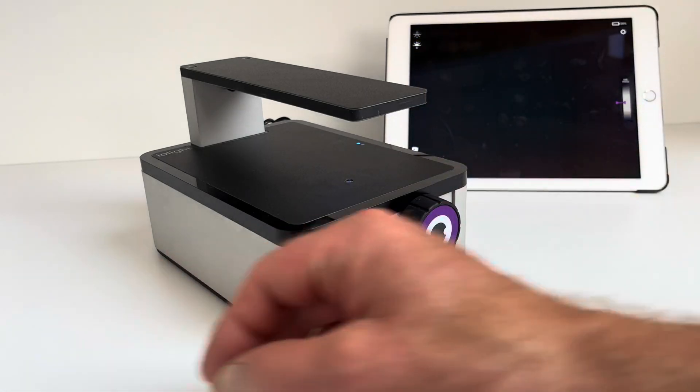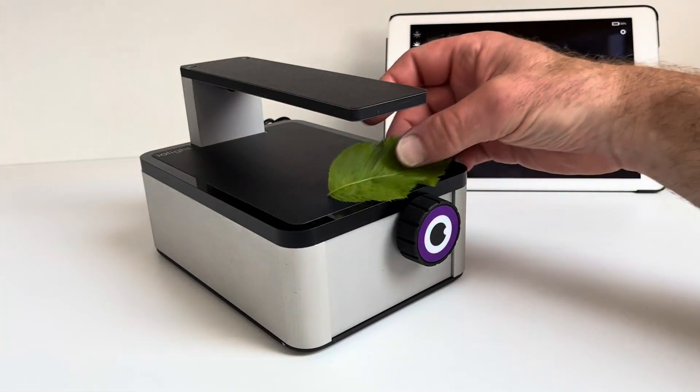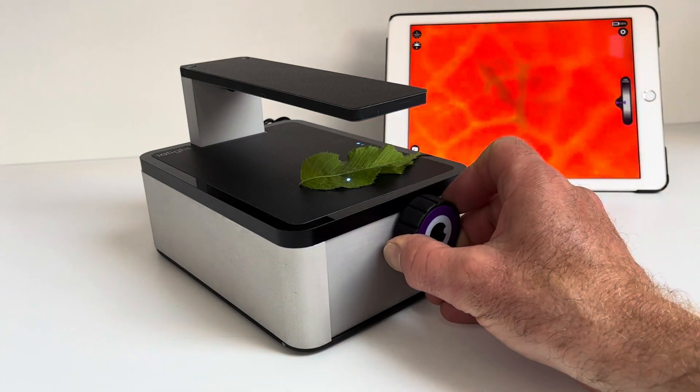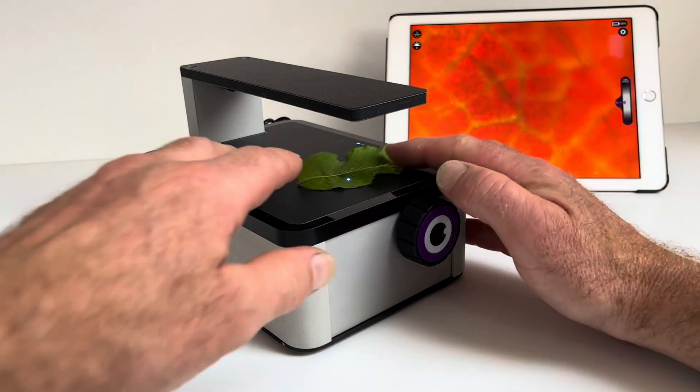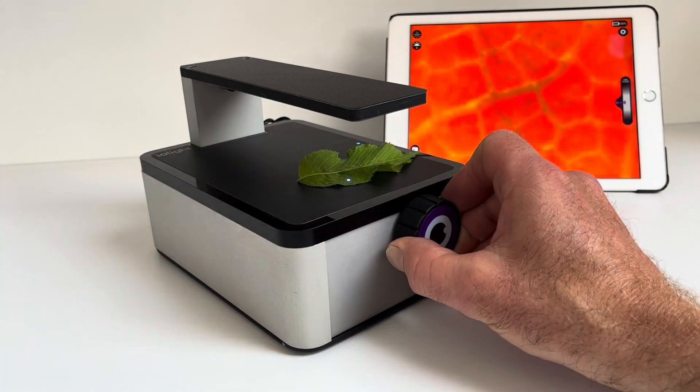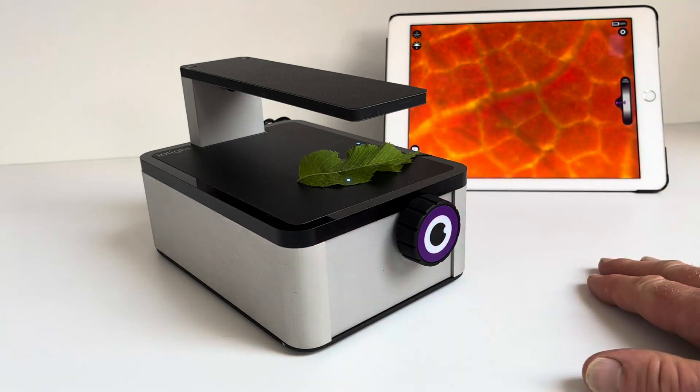Let's have a look at a completely different sample. This is a leaf I picked out of the hedge a minute ago. You can see the red fluorescence from the chlorophyll and the veins, and you can see the red fluorescence slowly dying as it bleaches in the blue light.